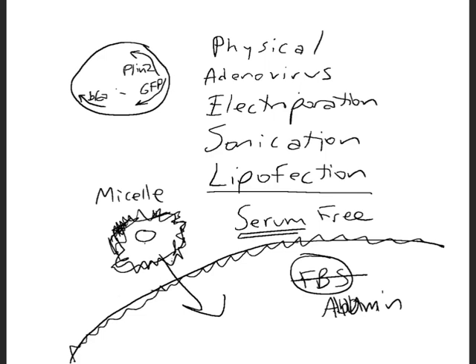The other thing that you have to do when doing this process is you have to make sure that you don't have a lot of liquid. And the reason for that is the following. Let me go ahead and erase most of this.